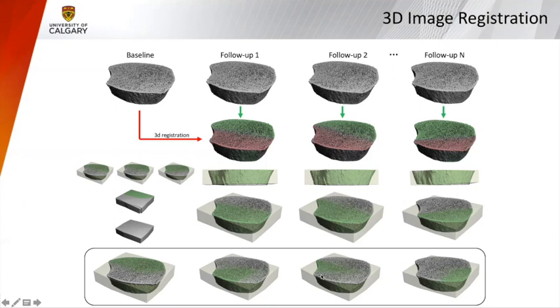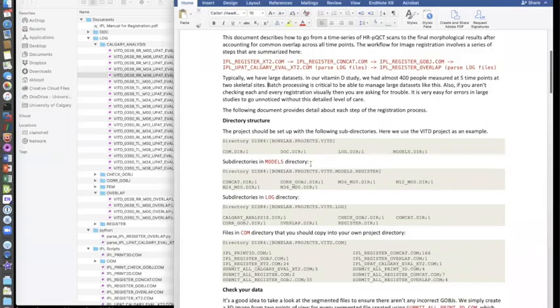Finally, what we also do is, sometimes it's useful to know how much overlap there was in a time series. That's quite simple. Once we have a common region that we can look at each time point, we can find what percent that common region is of the baseline maximum region, 168 slices with no registration.